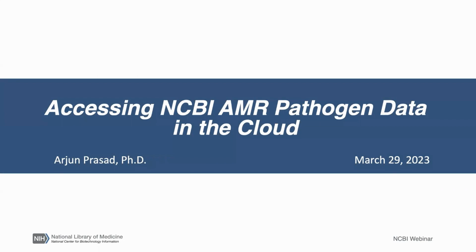All right. As Peter said, I'm Arjun Prasad and I'm on the pathogen detection team at NCBI, and I'm going to tell you a little bit about how to get access to our data in Google Cloud and how to work with it a little bit.